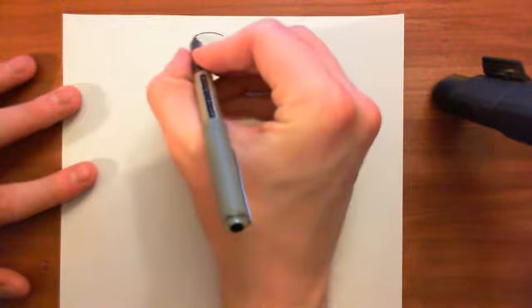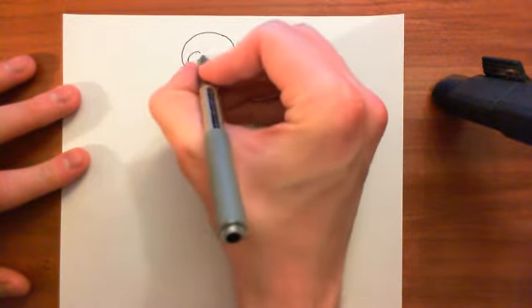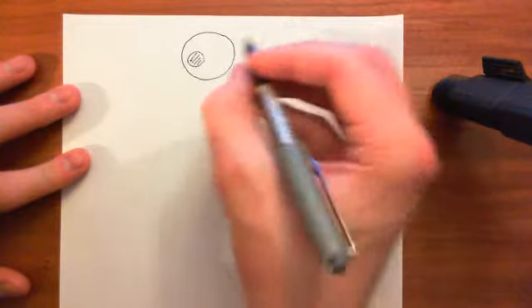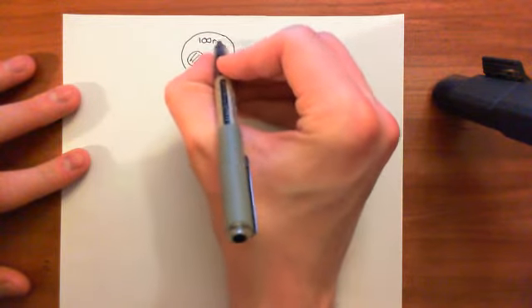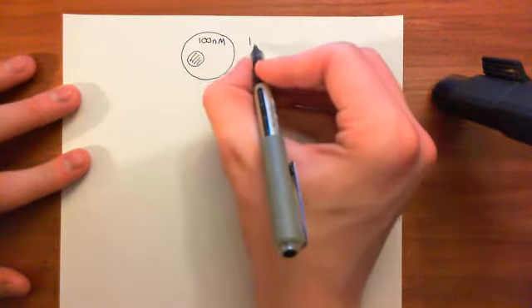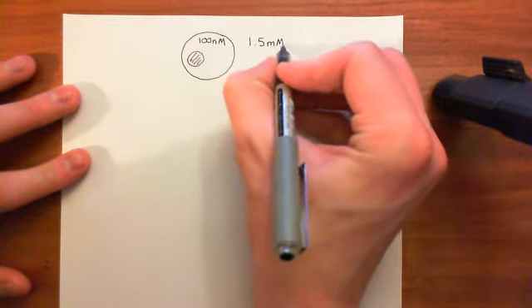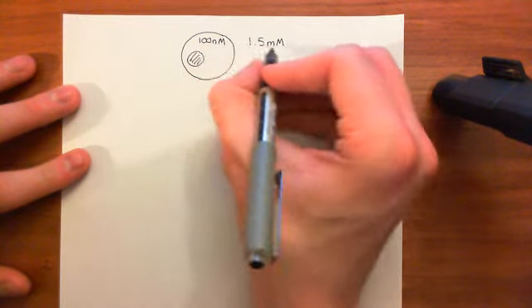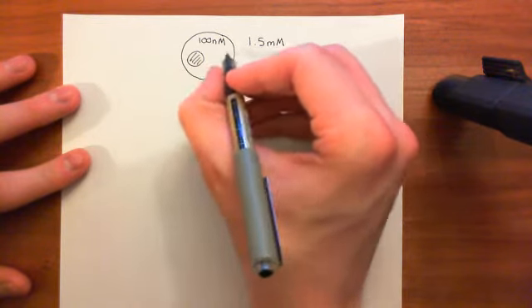The calcium concentration in the cytoplasm of cells is very, very low. Okay, so let me just draw a little picture of a cell here. So this is our cell here, here's our nucleus. Right, so the normal cytosolic calcium concentration is 100 nanomolar. That's small. Compare that to the extracellular calcium concentration, which is 1.5 millimolar. Okay, that means there's a 15,000-fold gradient of calcium across the cell membrane.